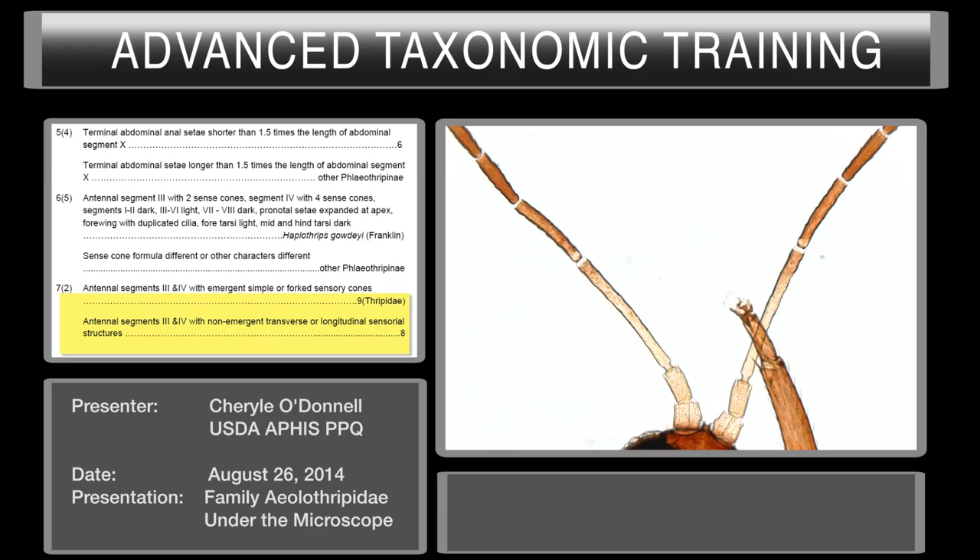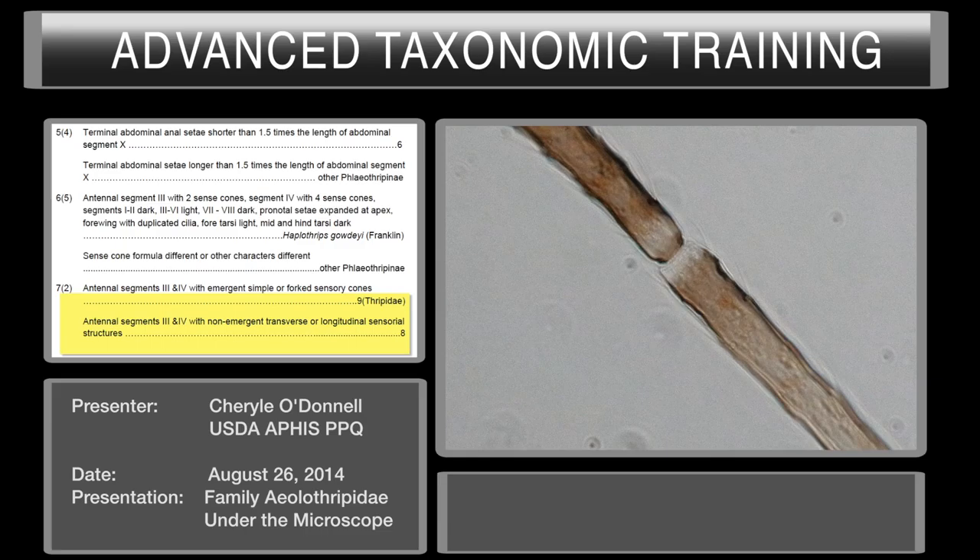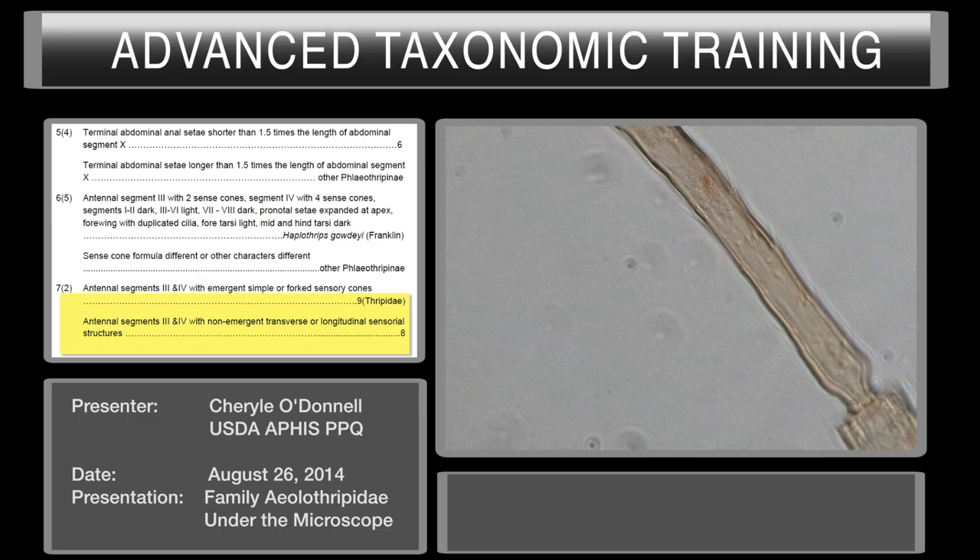Our next couplet will ask you about antennal segments three and four. Move your specimen to antennal segments three and four — we count from the base: antennal segment one, two, three, and four. This couplet asks for the type of sensoria. The first part of the couplet asks for simple or forked sensory cones. We do not have that here on this specimen, so we go to the second part of this couplet, which asks for non-emergent transverse or longitudinal sensorial structures. You can focus in up or down and should be able to see those structures on this specimen.